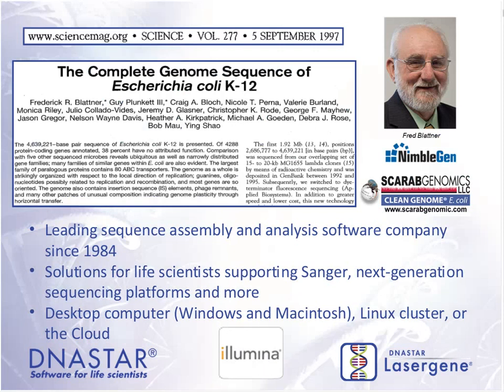We support Sanger and next-generation sequencing platforms, including Illumina. Our software runs on Windows and Macintosh computers, on Linux computers, and also the cloud. And we'll also take a look at BaseSpace and our SeqMan engine towards the end of the presentation today.